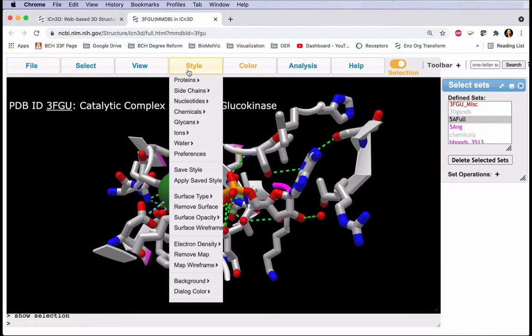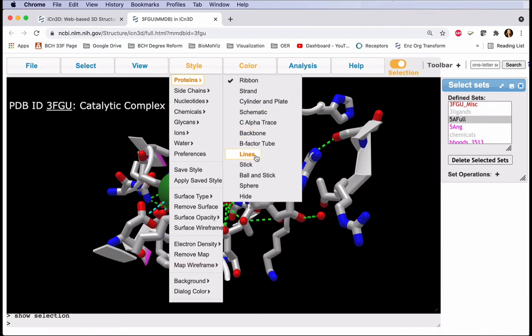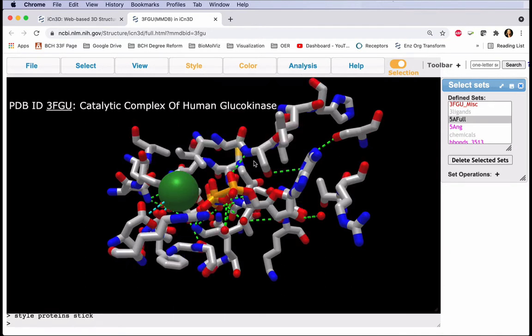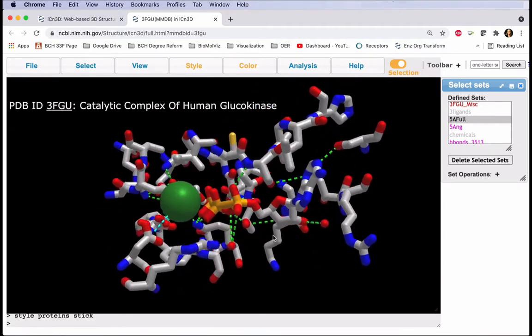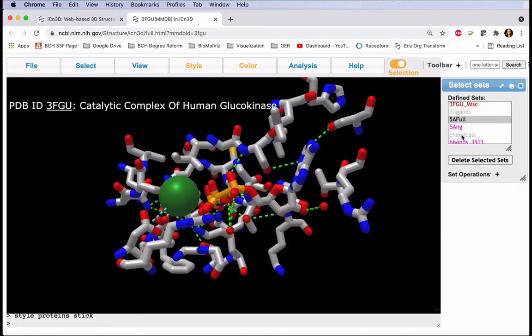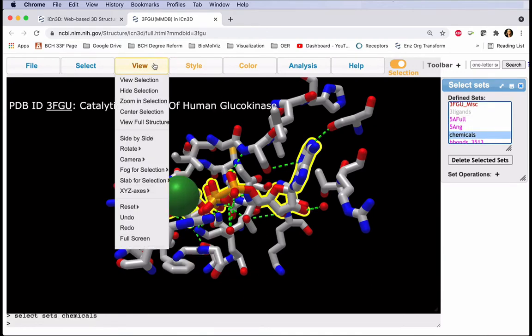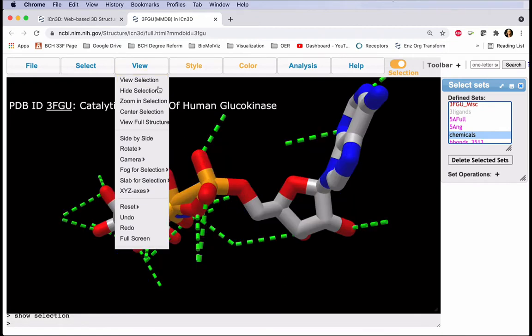So in the Style menu, Proteins, Select Stick. It's a bit challenging to differentiate our ligands from the protein because everything is colored the same. So in our Select Sets menu, we'll click on Chemicals and view that selection.